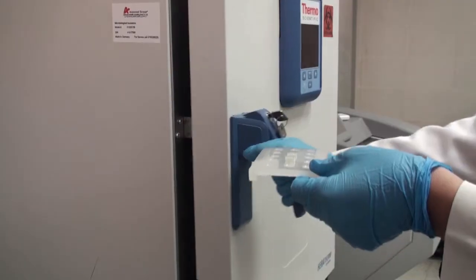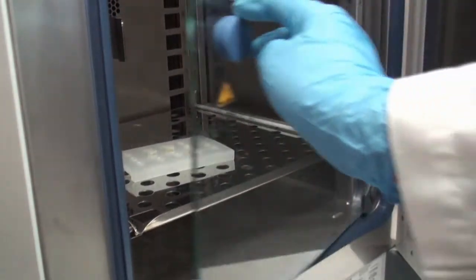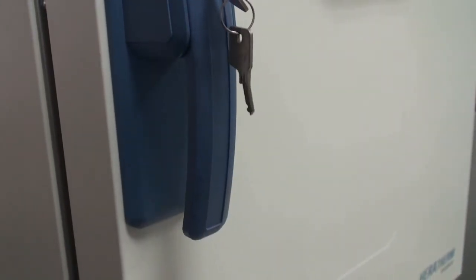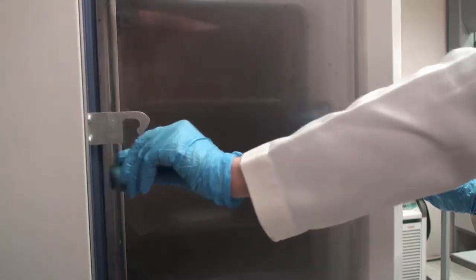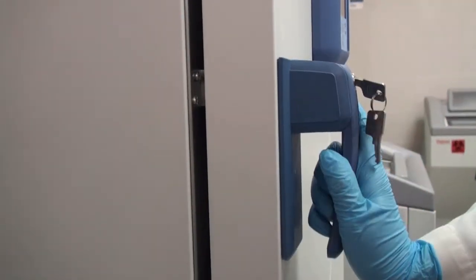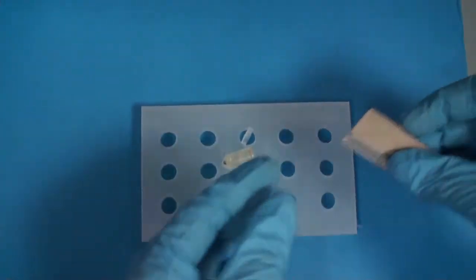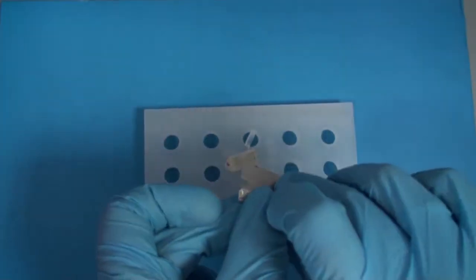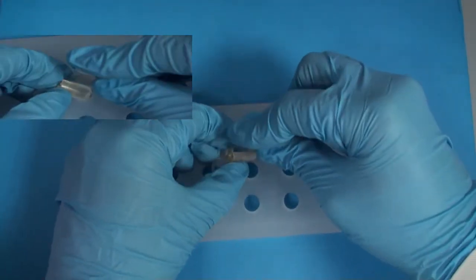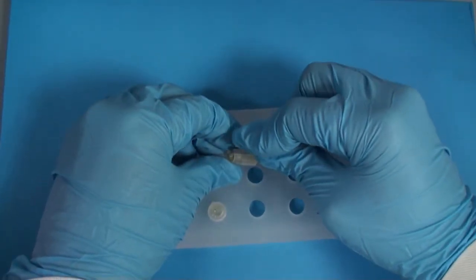We place our bullets filled with resin inside the oven and leave them overnight at 60 degrees. After the overnight incubation, we remove the sample where the resin has completely hardened. After the bullet is removed from the oven, we leave it to come down to room temperature, and then using a blade, we cut off the plastic bullet to reach the hardened resin.